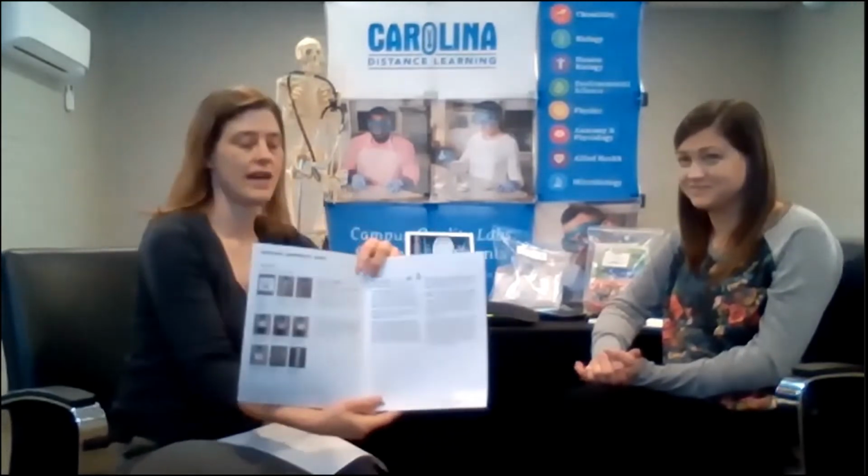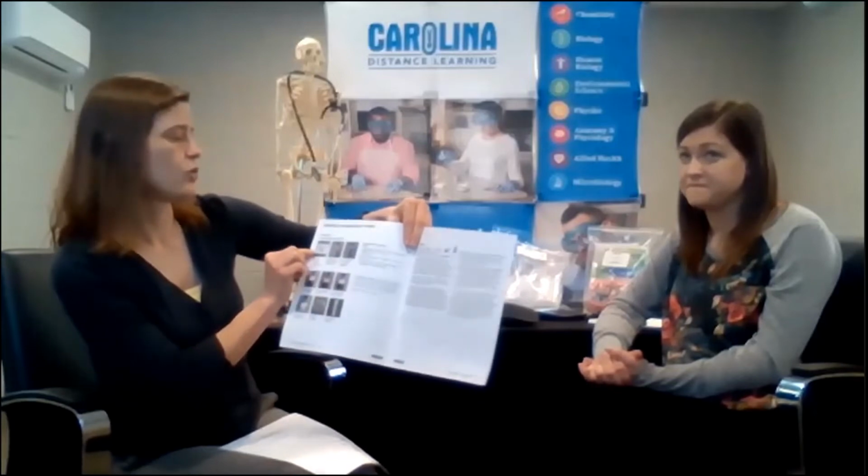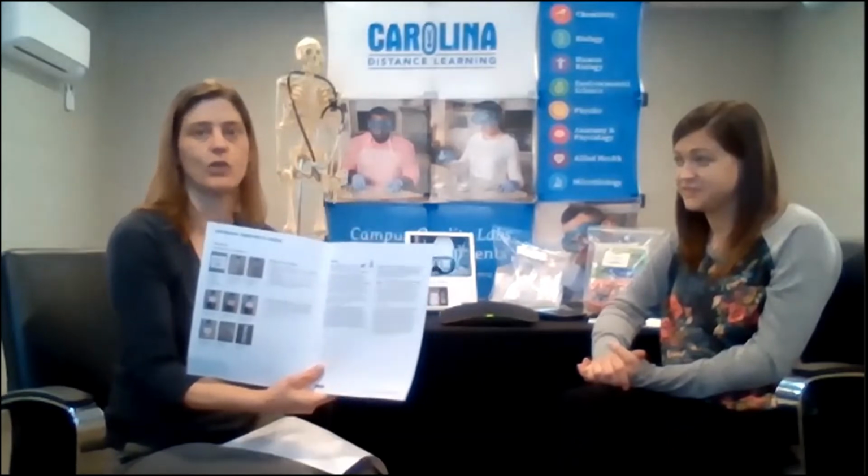After the background, we have the materials section. So we've got a list of the materials and where they need to find them. So for example, in your materials kit that comes with the lab, you will have these items and where we have them pictured. We also have, if they have any equipment that they will need from the basic equipment set, we'll have that mentioned there too, so they know I need to get a graduated cylinder or a ruler.